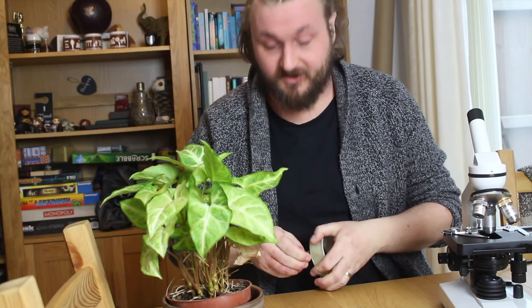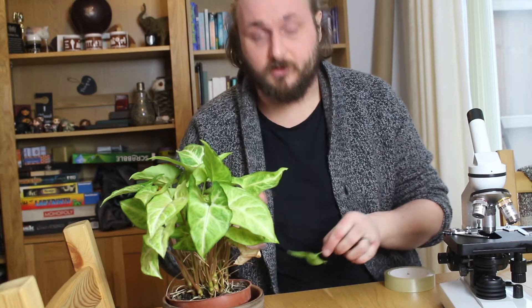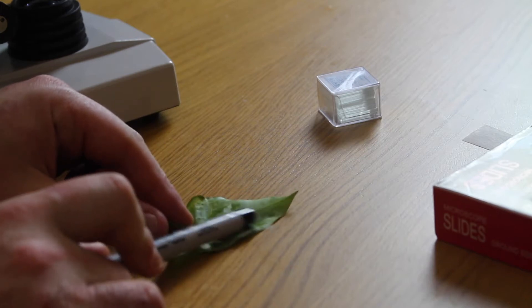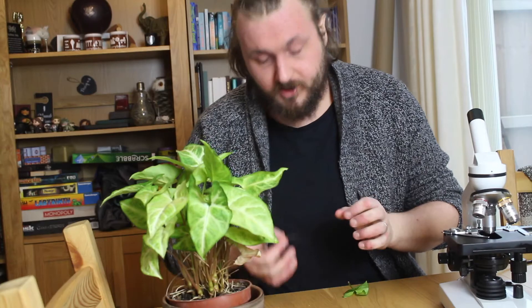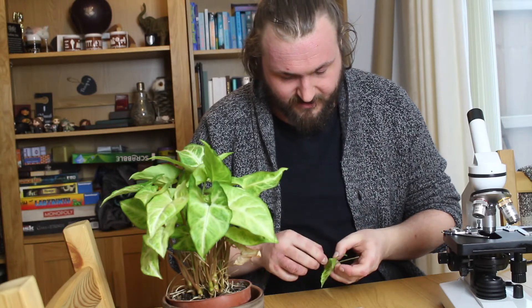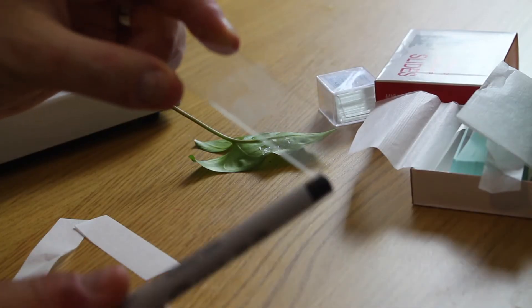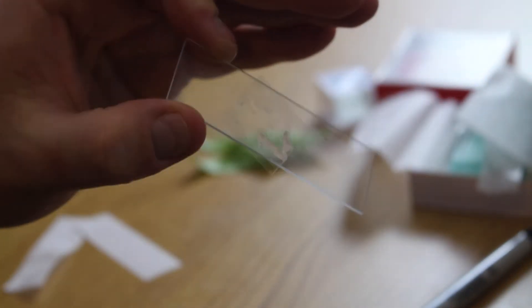Once the nail varnish has dried, you need some sellotape. Put your sellotape on your leaf, then use a bit of plastic or the side of a pen to rub the sellotape on the leaf so it forms a nice seal. When you pull off the sellotape you should see a stain — that is your dry nail varnish — and that should have the same pattern as the underside of your leaf. You then want to attach the sellotape to a microscope slide and smooth it down so it's fully attached and ready to use in the microscope.